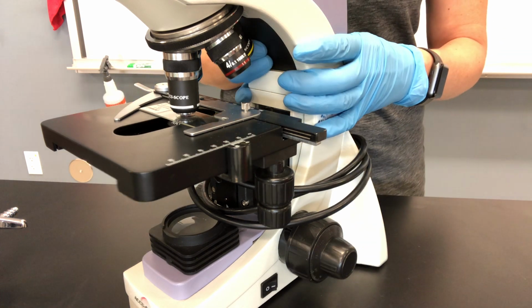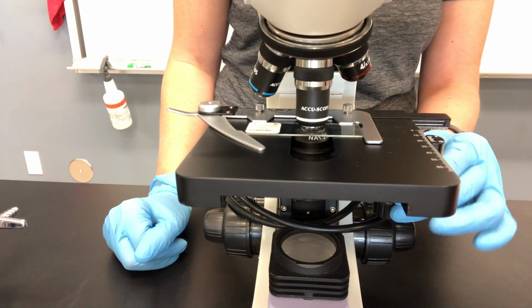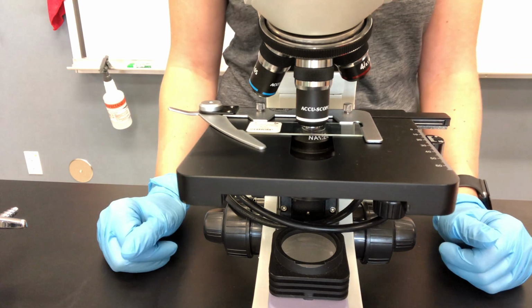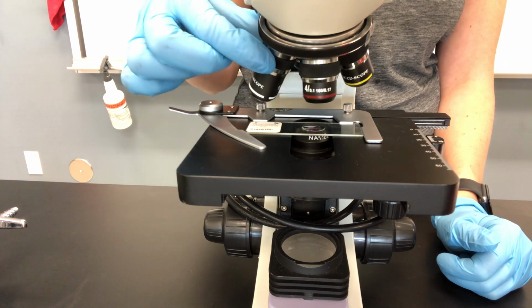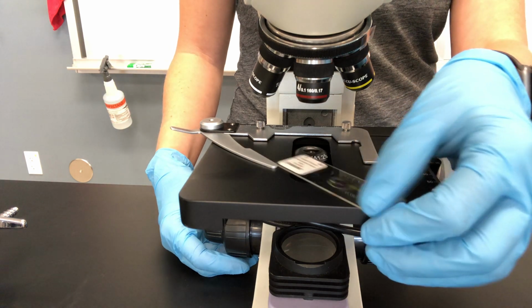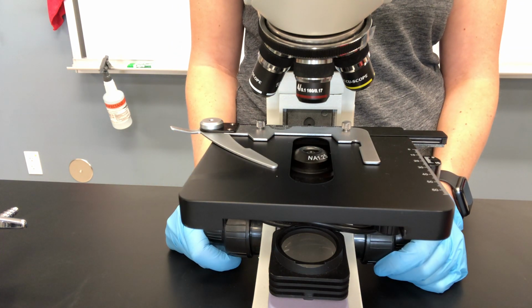When you are done, and you're like, okay, I saw everything I want to see. And by the way, you can scan around. The oil will track with your slide. So you can scan around on the oil. That's totally fine. When you're ready, you're going to click that scanning power back into place. You're going to lower your stage, take off your slide. You'll get that, and I'll tell you how to clean that in lab.